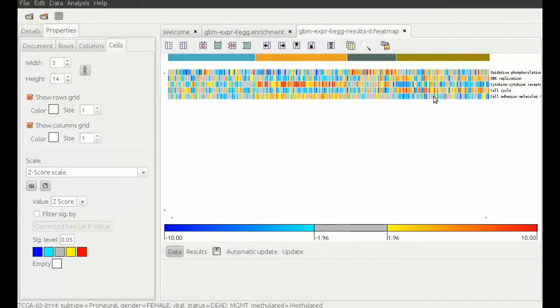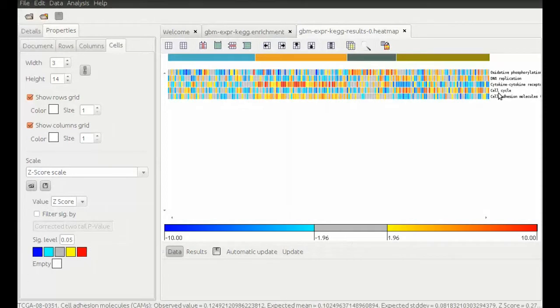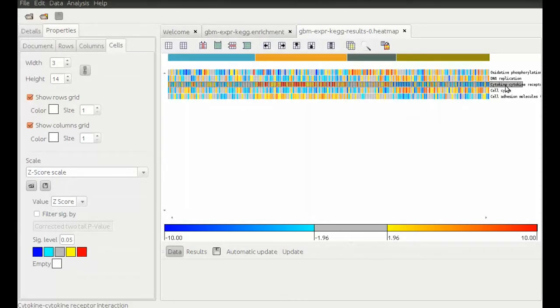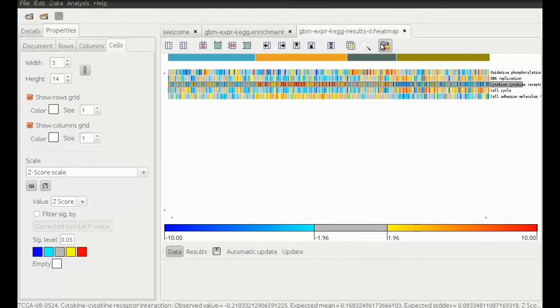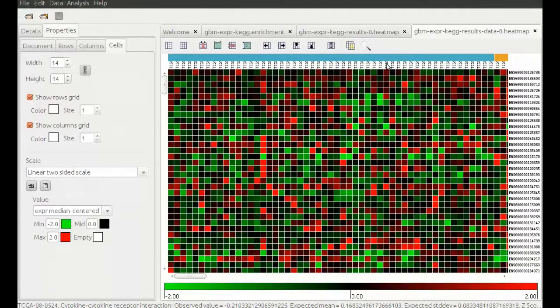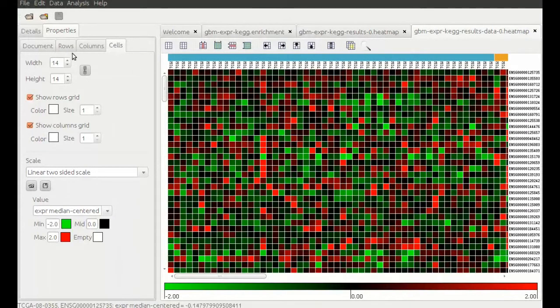If you are interested in what genes form part of a module, we can view the original data just for that module by clicking on the button on the top right and have the pathway of interest selected.